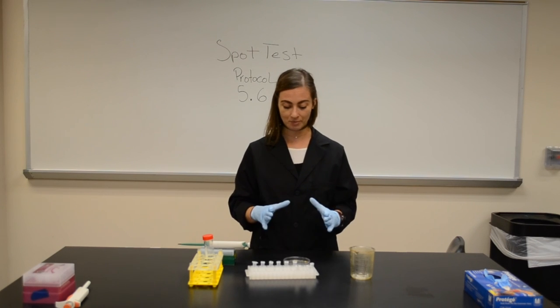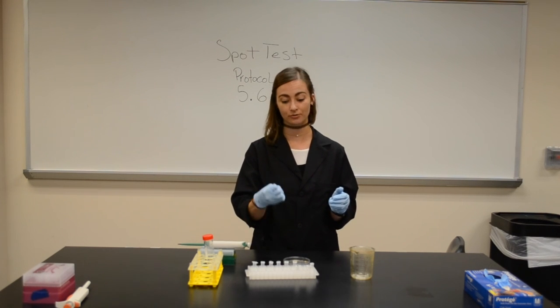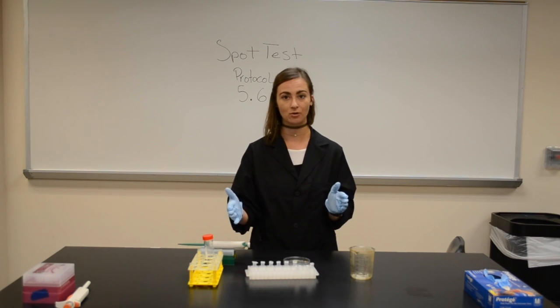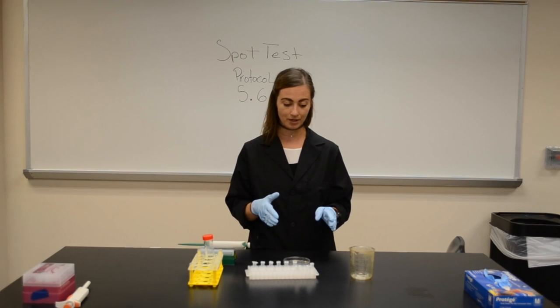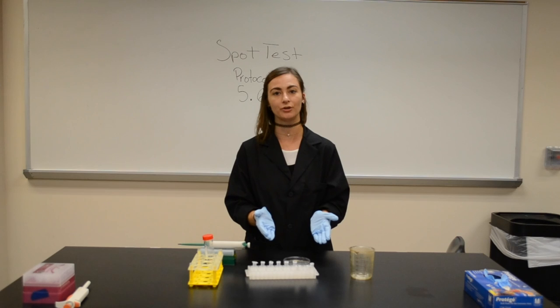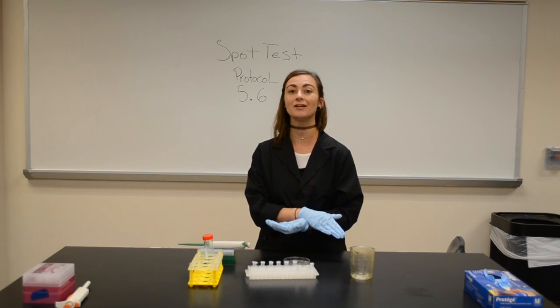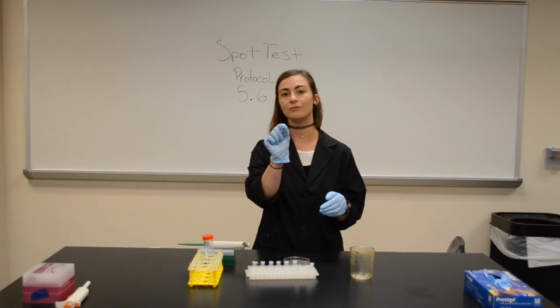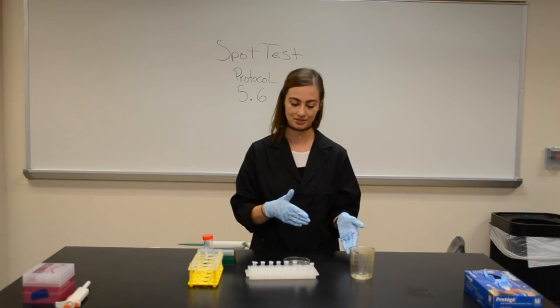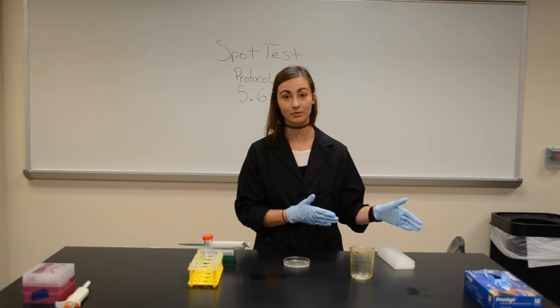So, with the spot plate, we have taken our filtrate and put a 3 µL spot right onto the mycobacterium lawn. How you'll know if you have phage is if you see a spot literally where you've placed that dot. How you'll know where you've placed that dot is by properly labeling the plate and having a little line delineating where you've placed that spot. Then we just set it aside and let it grow overnight.